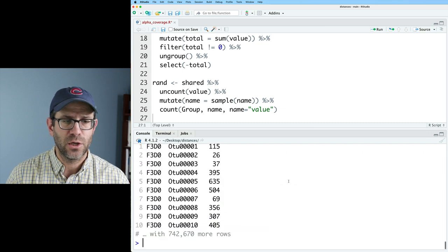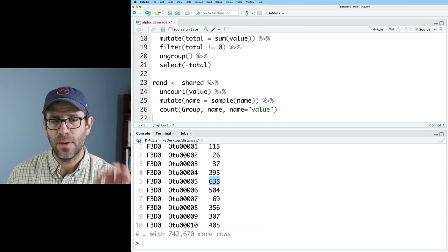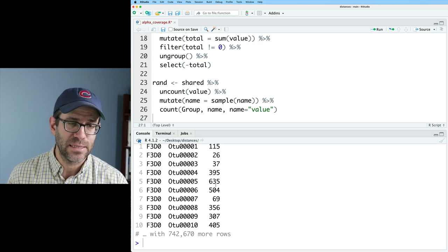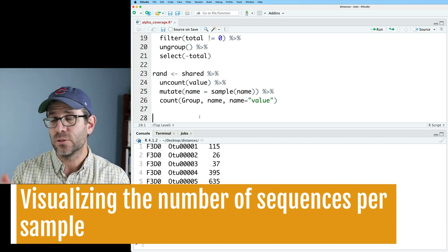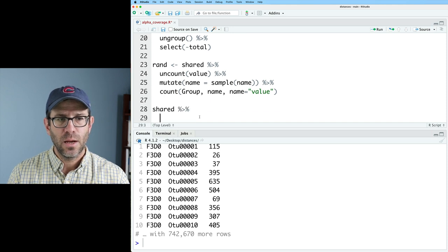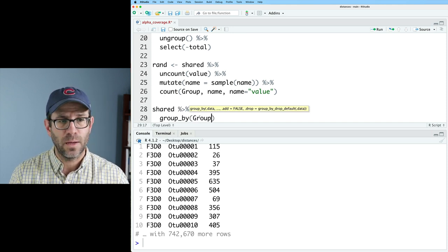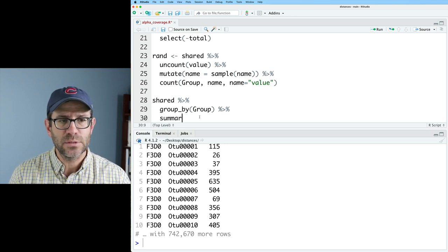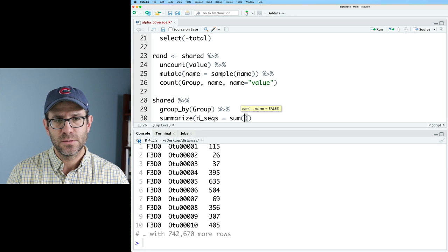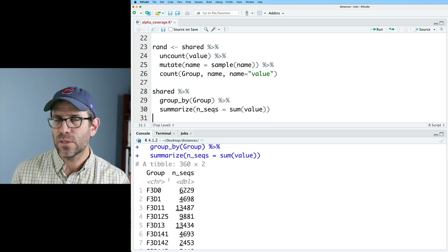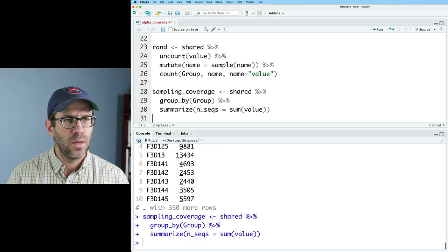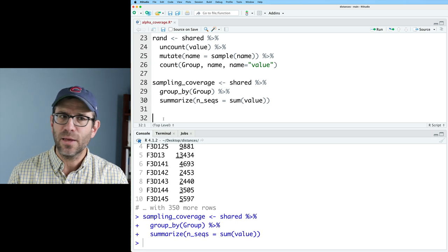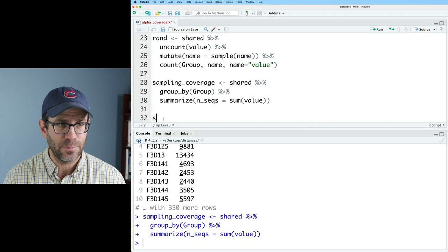So let's go ahead and load all this so we can have some data to play with. And again, if we look at shared, we see this three column data frame with the sample id, the taxonomic name, and the number of times we saw that OTU in that sample. I want to compile together the counts of the different OTUs so I can find out the number of sequences in each of the samples. So what I'll do is shared, pipe to a group by group, which is the name of that first column, and then we'll do a summarize to get the number of sequences, sum on value. And so now we have the number of sequences for each of our samples.